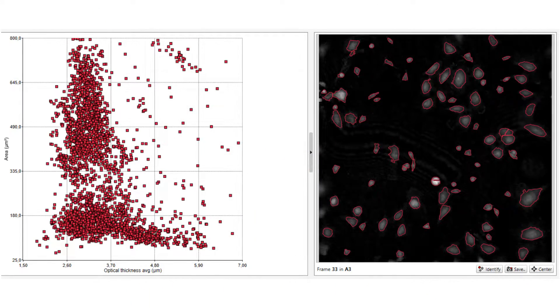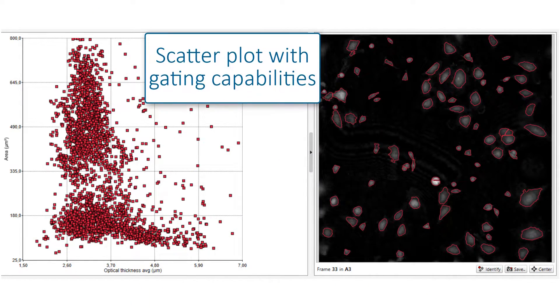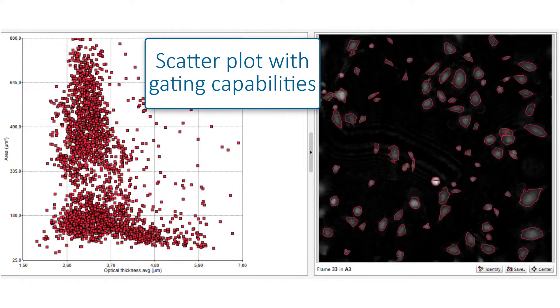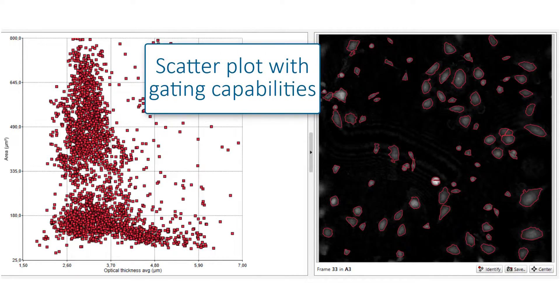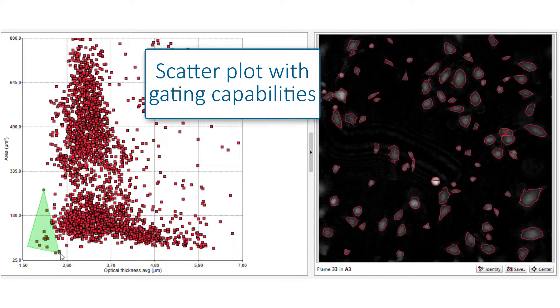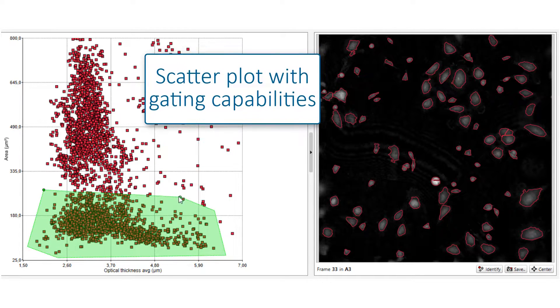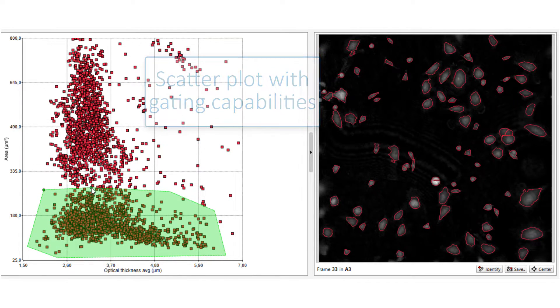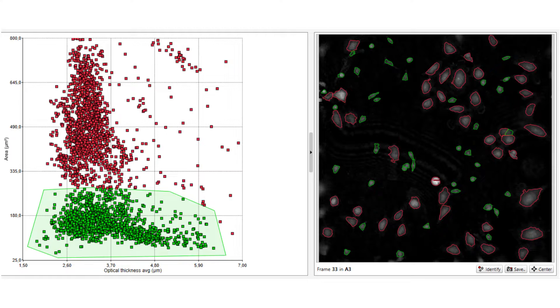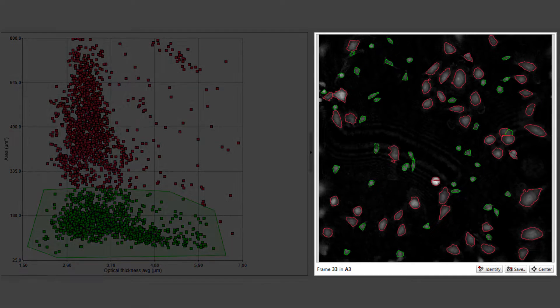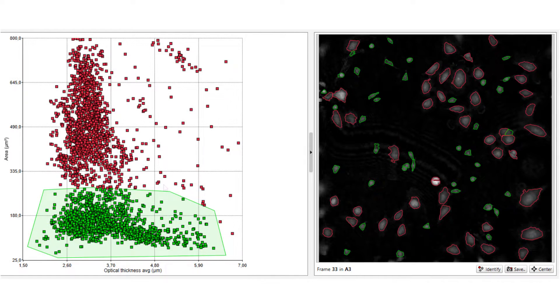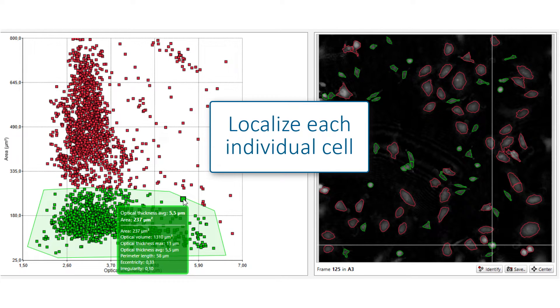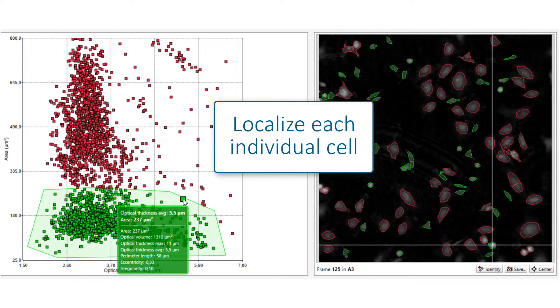The software also generates a scatter plot resembling flow cytometry analysis. Two parameters are plotted against each other and a gate can be applied to group cells based on their properties. Here, the green gate defines the subpopulation of smaller cells. For easy identification, the gate color is applied in the images as well. By pointing at the cell in the plot, the cell will be marked with a cross in the corresponding image.